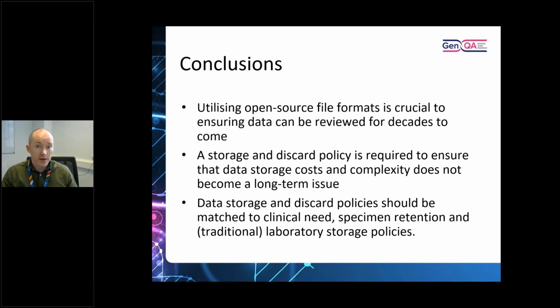A storage and discard policy is quite important because it gives you the comfort of saying, look, we've made a clear decision about why we keep these files for as long as we keep them, and we discard them after a certain time. There's good rationale for that, and it's discussed and hopefully agreed at a departmental level, if not national or at least best practice guideline level as well.